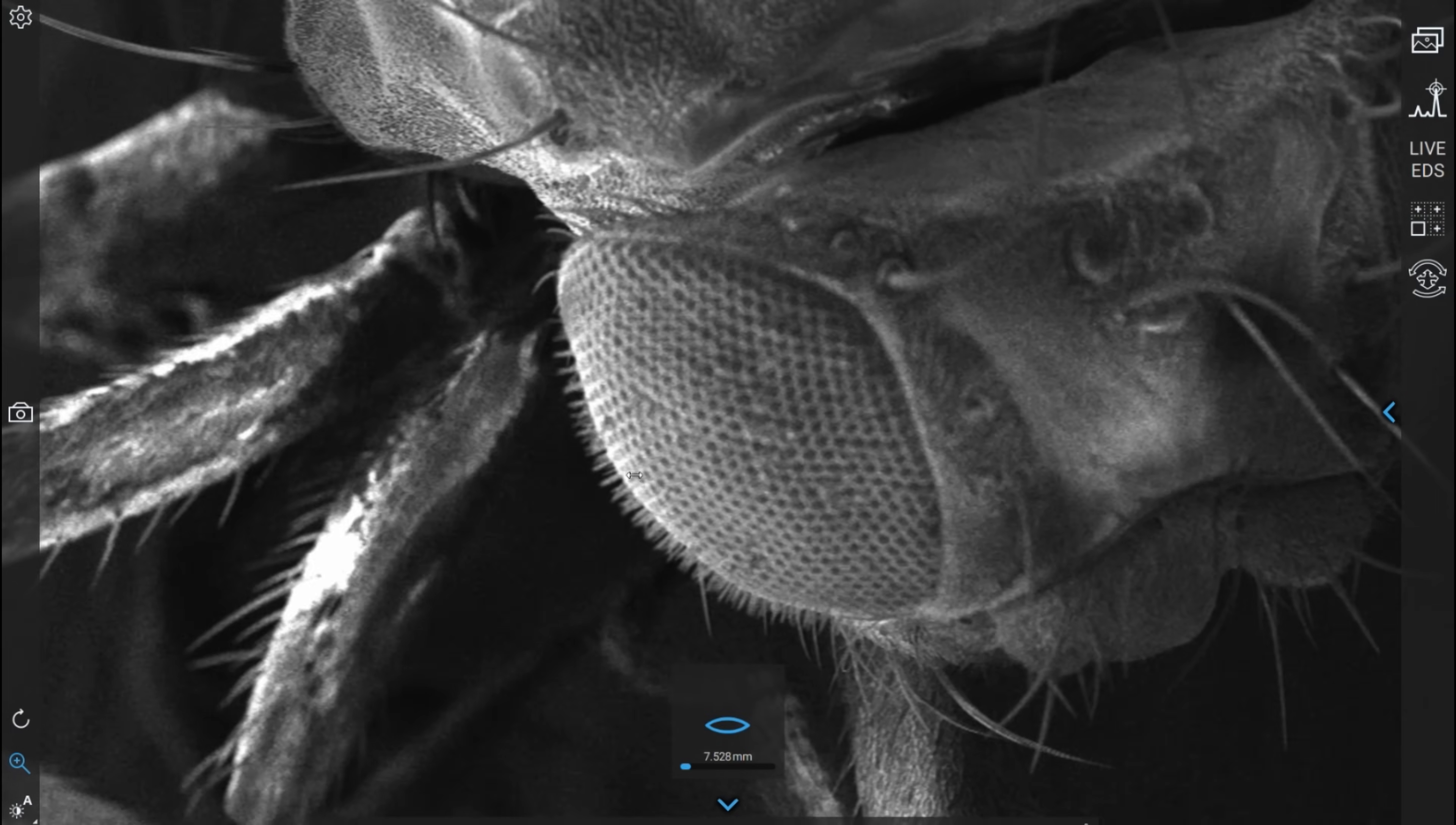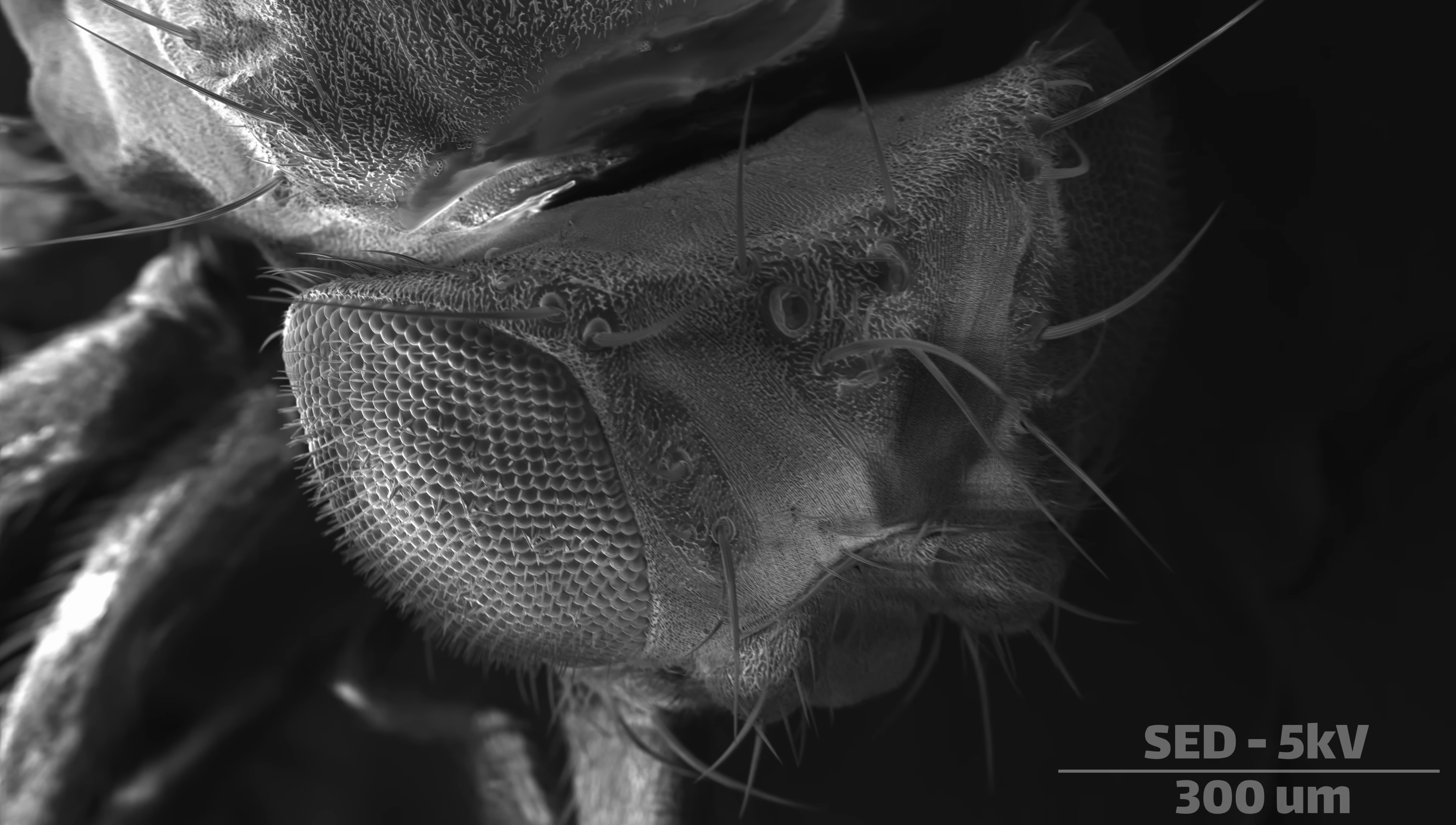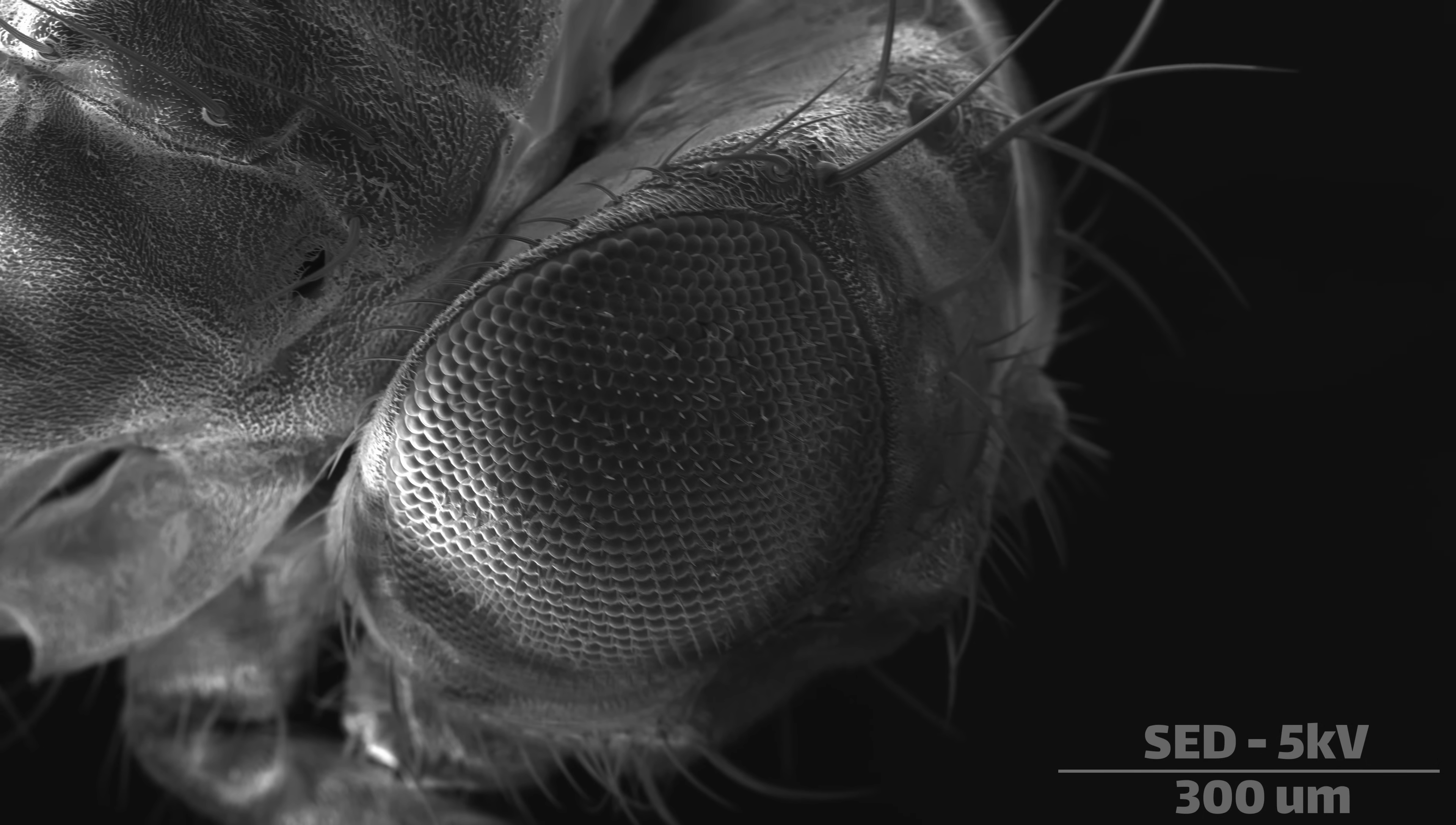Over 40% of the surface of a fruit fly is taken up by its eyes, so we'll start there. Each compound eye is composed of about 750 smaller hexagonal subunits called ommatidia. Each ommatidium has a large corneal lens on the top, which helps focus light onto photoreceptor cells underneath.